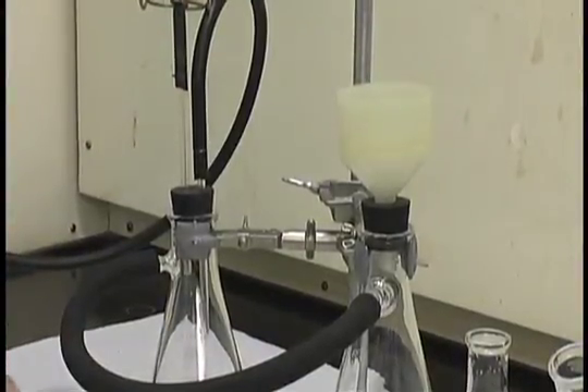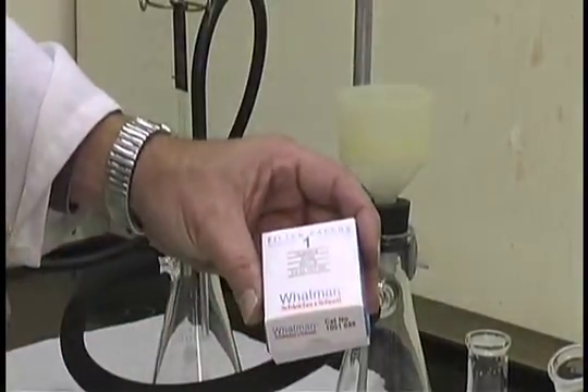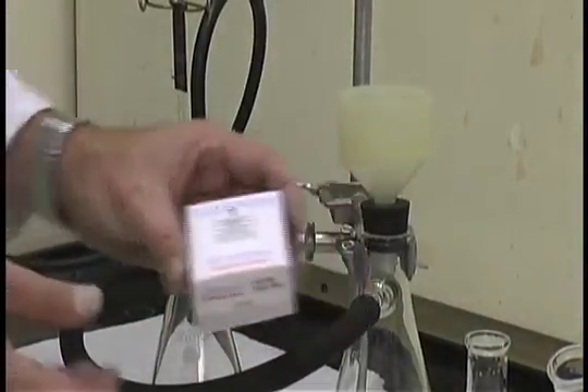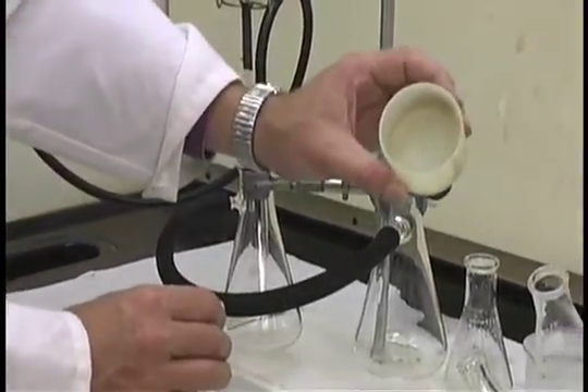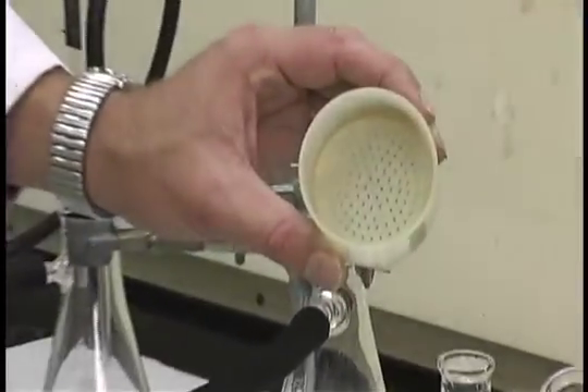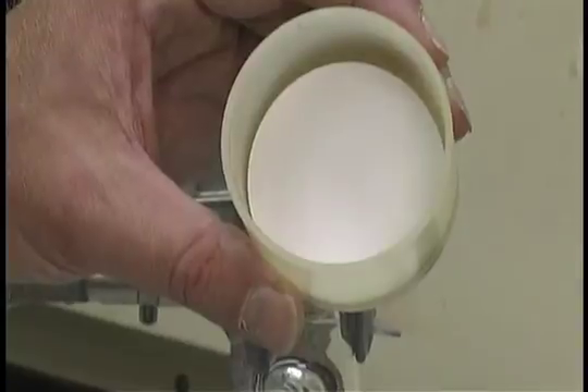Inside the funnel will be filter paper. The filter paper has to be of the appropriate size — it must cover all the holes in the Buechner funnel but not ride up the sides of the Buechner funnel.